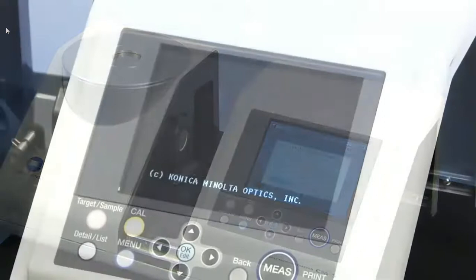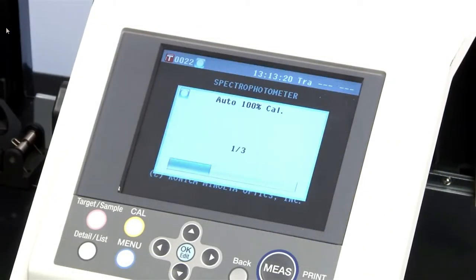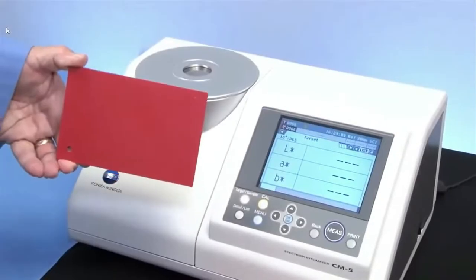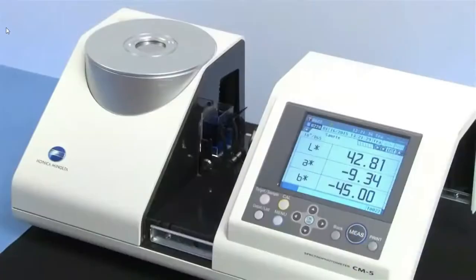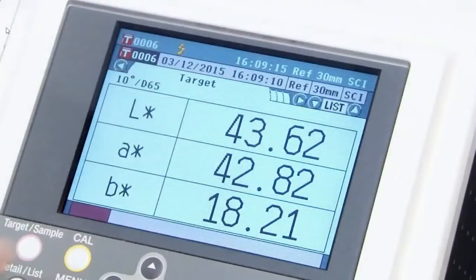Select the transmittance sample holder and press the measurement button. Scroll through a variety of results including Lab color difference, 3D color space, and spectral curve. Quickly switch various modes in reflectance or transmittance.